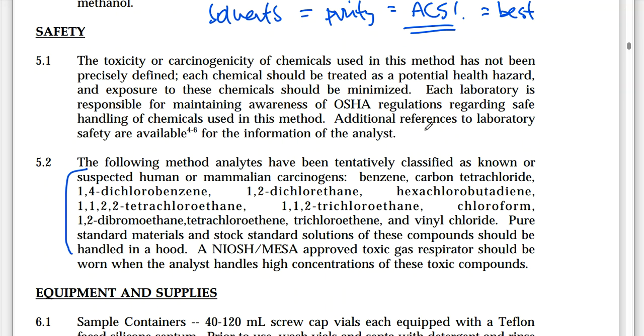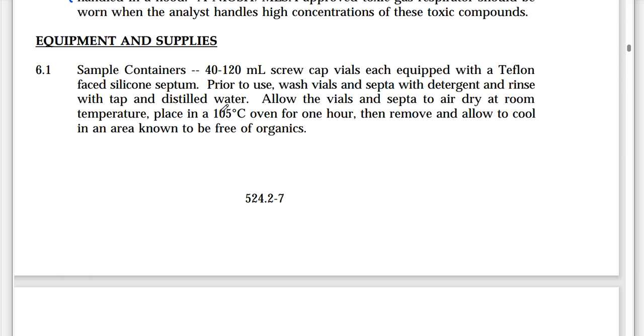All right. Next up are equipment and supplies. This is going to tell me the stuff that I need lab-wise in order to make sure that this method goes through the proper way. Now, keep in mind that equipment and supplies does not say reagents. So very often this will have its own dedicated section here, and the only thing that will be highlighted in this equipment and supply section will be exactly equipment and supplies. So everything from glassware to filter paper to tools that I need in a laboratory environment, including the equipment pieces, are going to be found in this section.